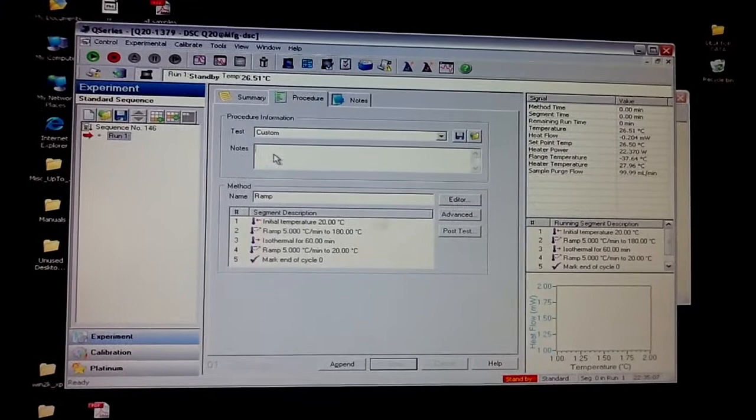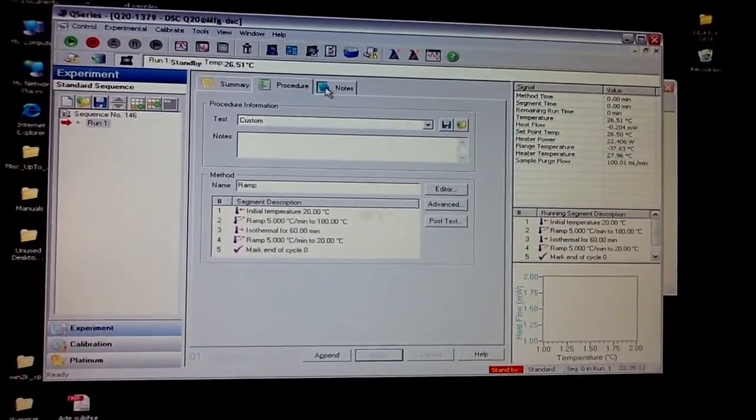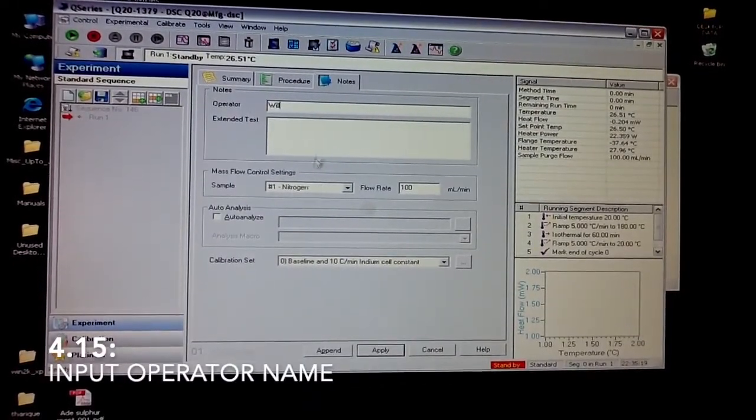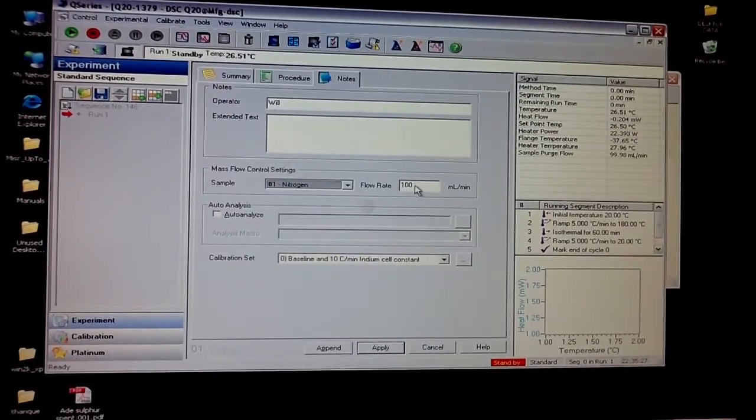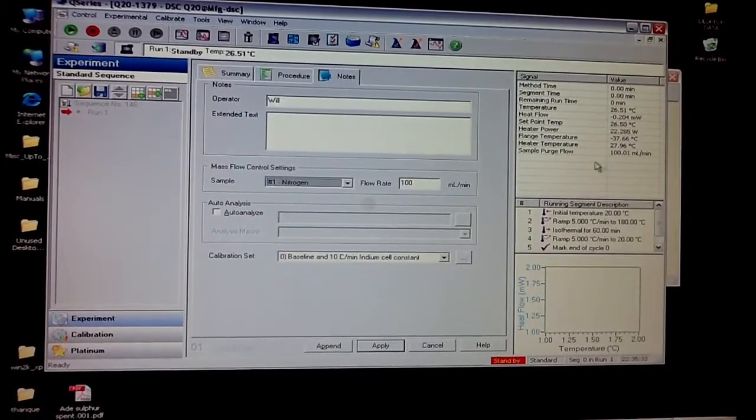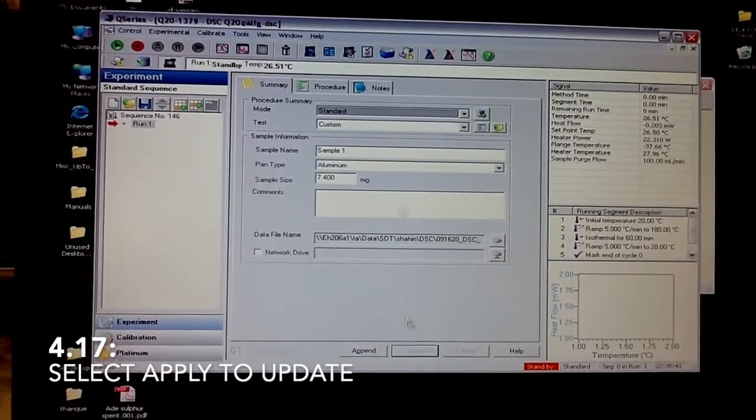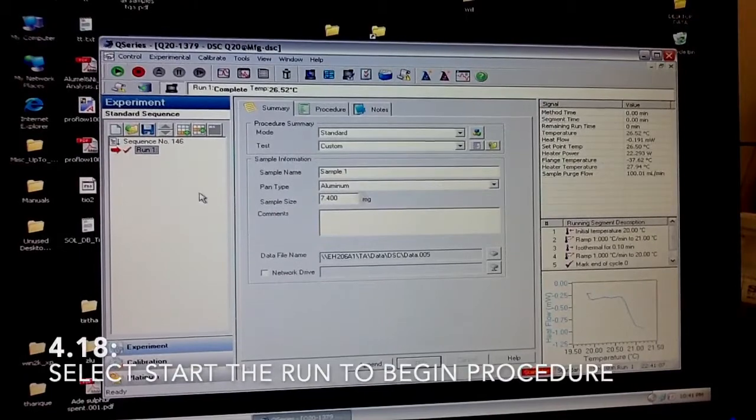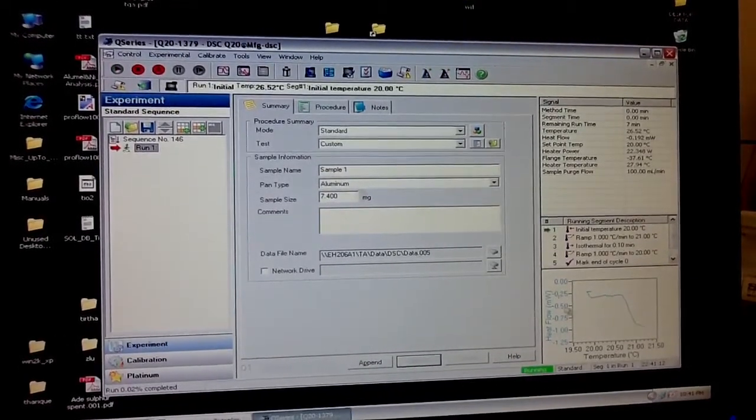You also can put in here a description of your test. And finally in Notes, you can put in the operator name. You can change this, but it should always be Nitrogen. And the flow rate should probably be 100 milliliters per minute. Well, you hit Apply. To start your test, you just head up here and hit Play. And it should show up here in the bottom right hand.